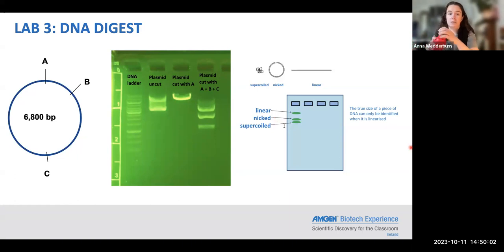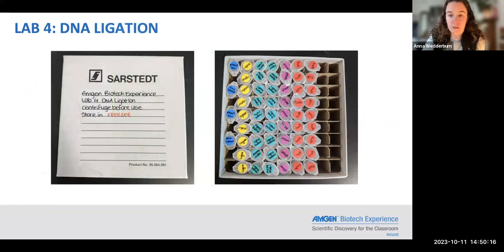Okay, so that is lab 3. Then lab 4. This is DNA ligation. So this is sticking DNA back together again.